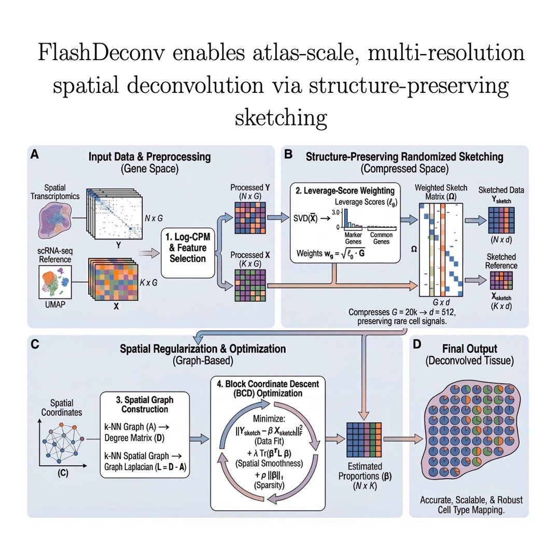They looked at Paneth cells, which are only at the base of the intestinal crypts, and goblet cells, which are distributed along the whole axis. So biologically, they're separate. They are spatially segregated. They should show a weak negative correlation, which they do at 8 microns. They kind of exclude each other.